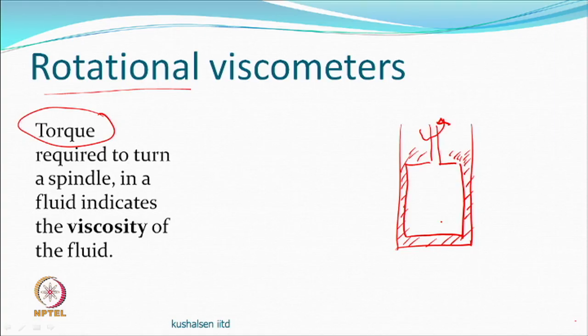Now, in this case, the distance between the inner portion of the container and the outer surface of the spindle could be very small or very large. If it is very large, then it is a story which is different, because here there is a material which is closed, which does not move at all, and therefore, the resistance offered will be different. So, the distance between them is also going to be a factor in calculating whether the viscosity is whatever you are measuring or otherwise different.